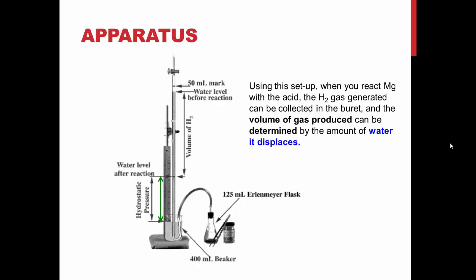To begin, set up a ring stand and attach a burette clamp. Fill a 400 milliliter beaker with approximately 250 milliliters of water and place it at the base of the stand. Fill a burette with water and invert it, placing the end into a beaker of water as shown. If the water level is above the 50 milliliter mark on the burette, drain it until it is below the 50 milliliter mark and read the initial volume of water in the burette to two decimal places.